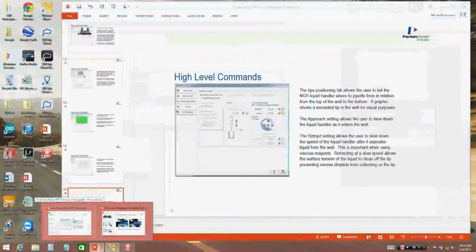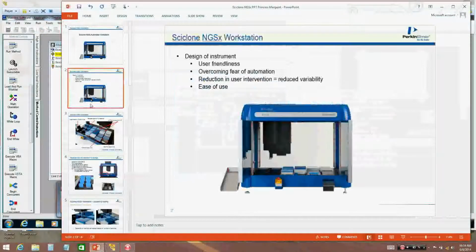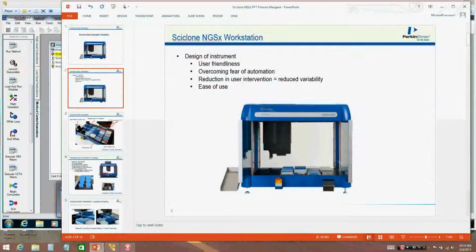These doors have optional settings, you can turn them on and off. You can enable the left or the right one, or shut them both off. When I say enable, it enables a safety switch, so if you were to open the door, you can have the method stop automatically, and you would be prompted. It would say door is open instead of what my message is saying.